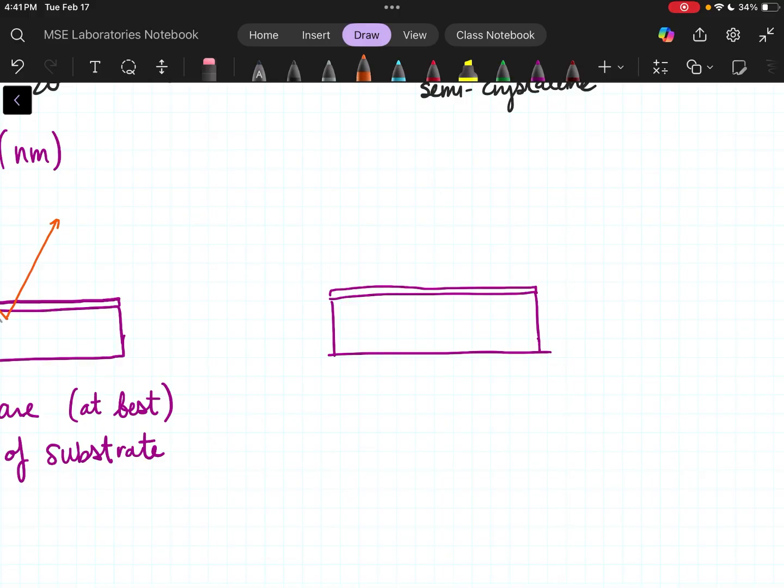Right. So our solution is we've got our substrate, same thing, big old substrate, tiny little film. And what we do is we actually let the source come in at a really, really low angle. I am talking like 1 degree 2 theta. Let me see if I can draw that properly. I just drew like 8 lines to get 1 line. We're gonna try. And this is omega equals somewhere between 1 and 5 degrees.